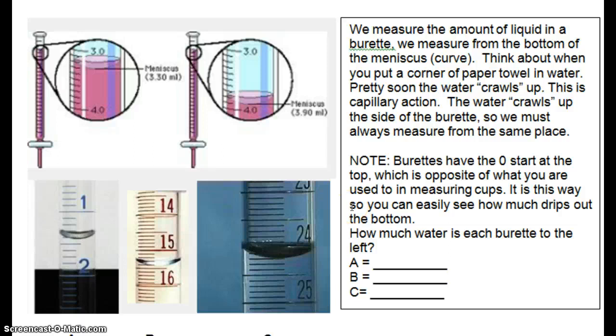We measure the amount of liquid in a burette. We measure from the bottom of the meniscus. Meniscus is a fancy word for a curve. If you wear contact lenses, they probably have this shape, and right there would be the bottom of the meniscus. Think about when you put a corner of paper towel in water. Pretty soon the water crawls up. This is capillary action. The water crawls up the side of the burette just like it crawls up a Kleenex or a paper towel, so we must always measure from the same place. All right, note, burettes have the zero start at the top, which is the opposite of what you are used to in measuring cups. It is this way so you can easily see how much drips out the bottom.